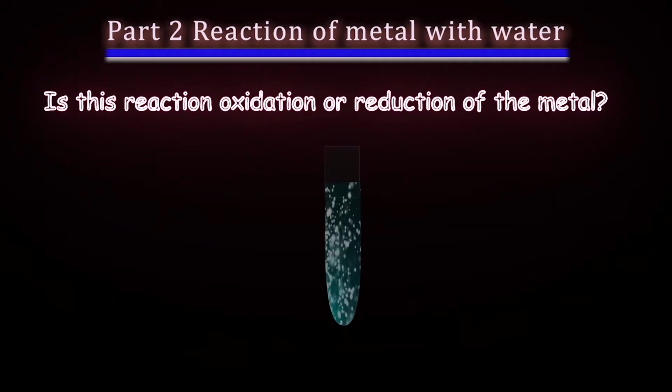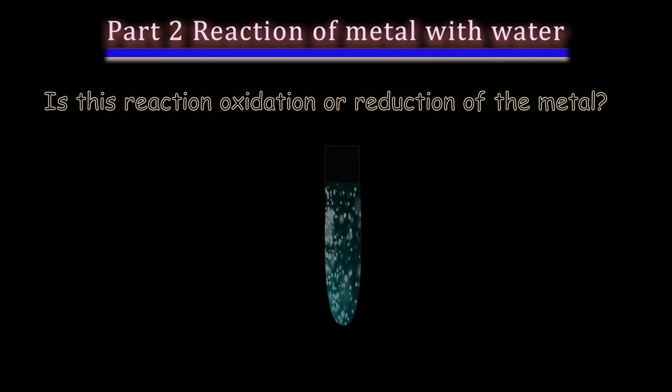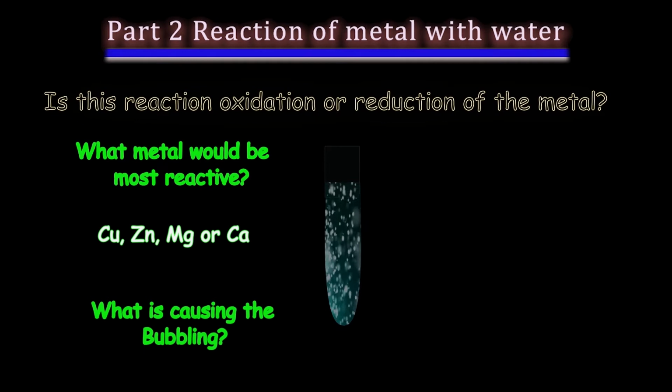Is this reaction an oxidation or reduction of the metal? What metal would be the most reactive? What is causing the bubbling? At the end of the video, answer the questions in your Chem 110 lab manual for this experiment.